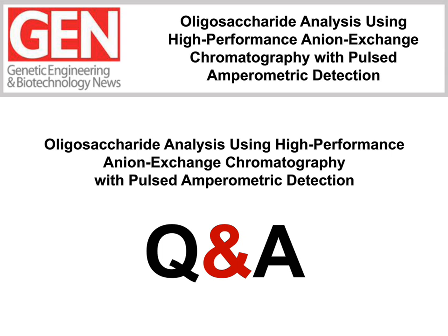What I talked about today is using electrochemical detection with a gold electrode for carbohydrates, and certainly there's a variety of carbohydrates, as the one slide showed, that we can do that with. If we just had a gold electrode and then changed the column, there's a number of different other compounds we can detect, most notably amino acids, and then sulfur-containing compounds where the sulfur is not in a fully oxidized state, something like a thiol. Antibiotics often have sulfur in this state, so the system's been used for antibiotics, but anything that sulfur isn't fully oxidized. Now, if it's a sulfate, that's fully oxidized, and we wouldn't be able to detect that.